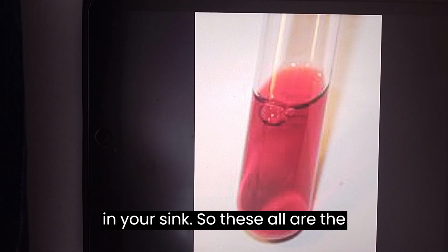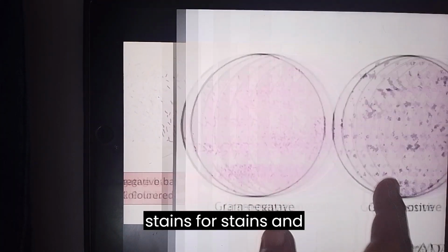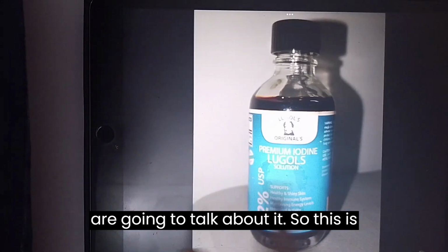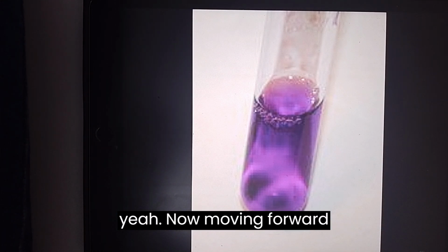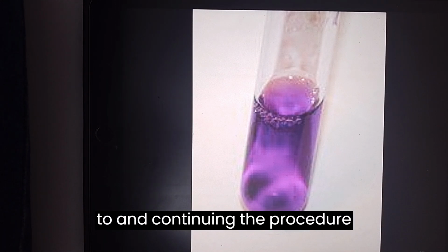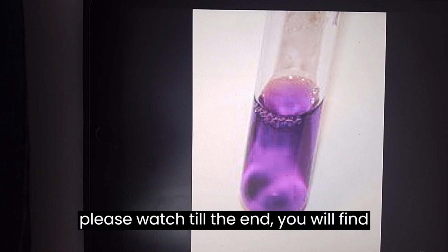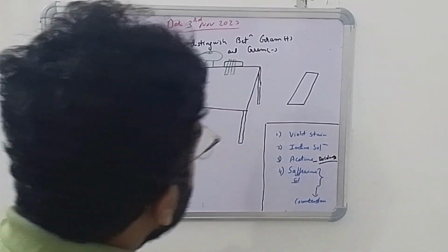So these are all the stains, four stains, and this is the image of smear microscopy. We are going to talk about it. This is the rack, this is the Lugol's stain, and this is the crystal violet stain. Now, moving forward and continuing the procedure of this Gram staining, please watch till the end. You will find the smear microscopy explanation also. The four solutions, or four agents.